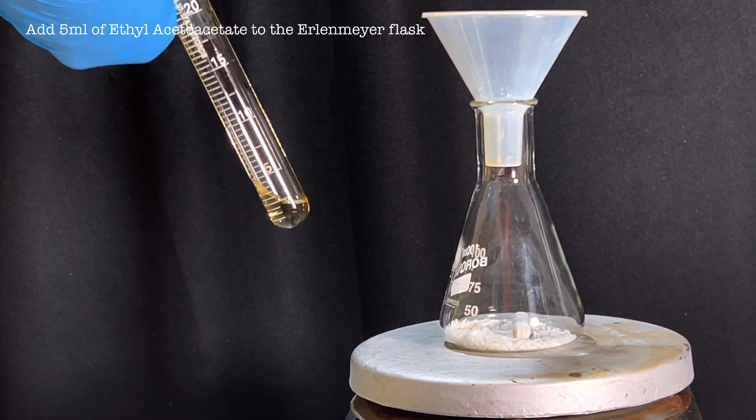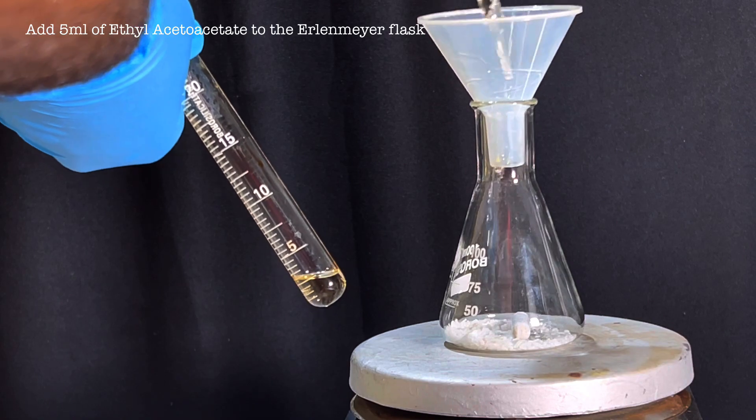Next, 5 ml of ethyl acetoacetate was added to the flask using a glass pipette.